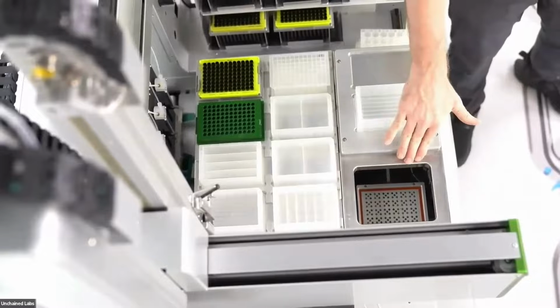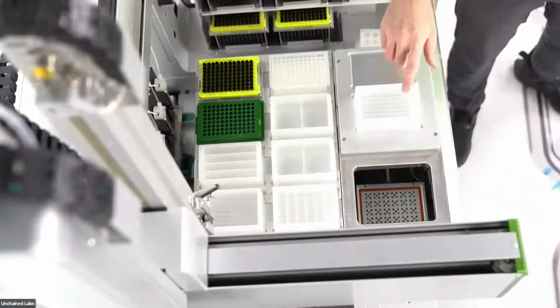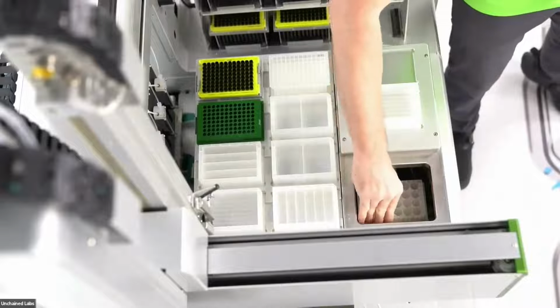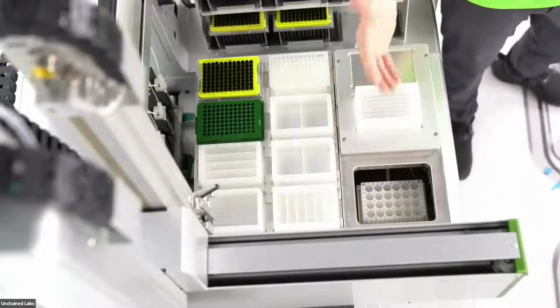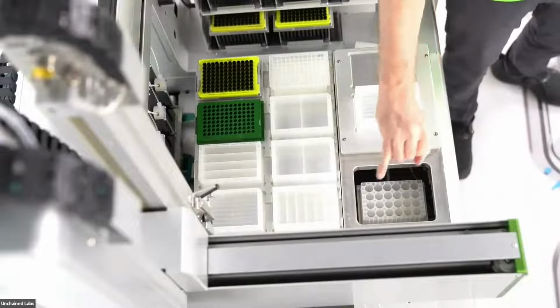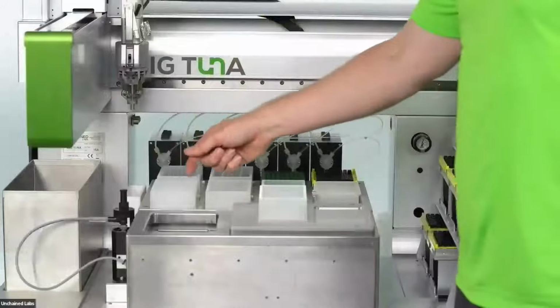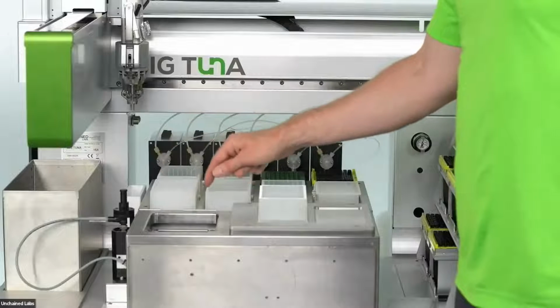This is the buffer exchange chamber. It's identical to the one that you will find on the Unagi. And that is where, I'll just place it in there now so I don't forget it, your unfilter goes. Now, one thing I had left out that both Unagi and Big Tuna have is that they do volume measurement on a sample-by-sample basis. We'll see this in action in a little bit, but essentially this ultrasonic volume sensor is picked up, and at the beginning of a run and in every single buffer exchange cycle, the exact volume of every single sample is tracked.